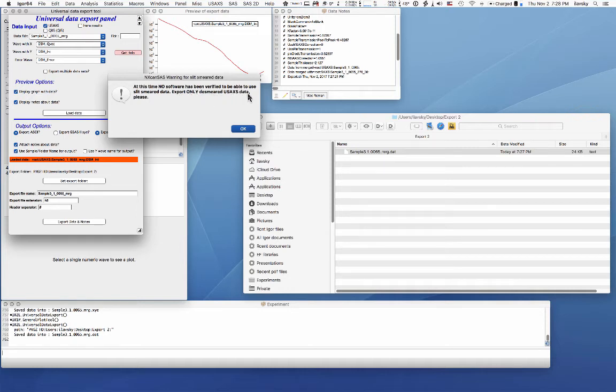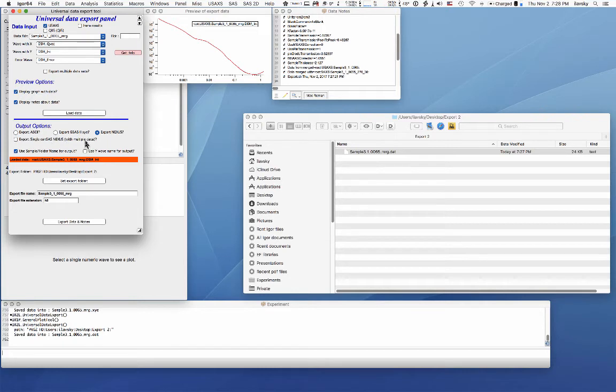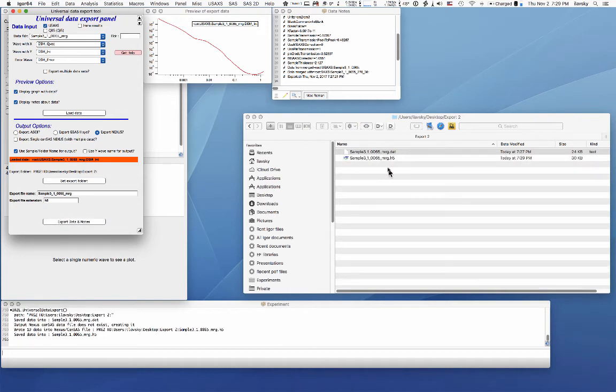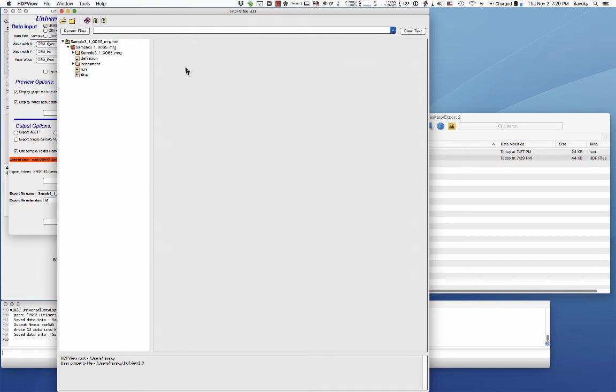It will warn you that since I don't know about anyone able to use slit smeared data, you have to de-smear them first. So it basically says you need to be worried about exporting this. You say yes. You have a choice of exporting single CanSAS Nexus with multiple data or multiple Nexus files. Depends what you want to do. And then you can simply hit export.